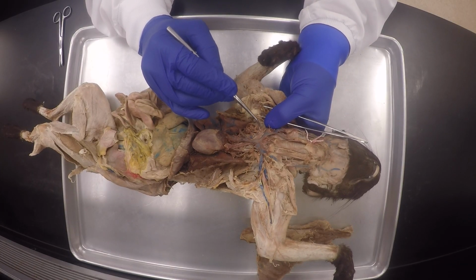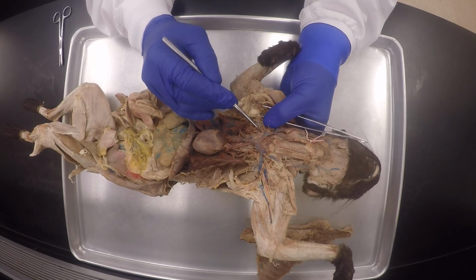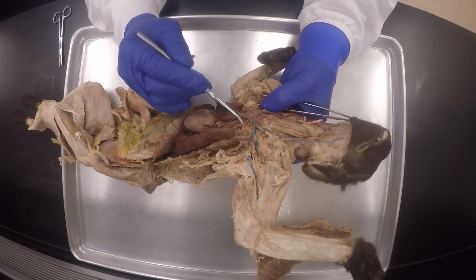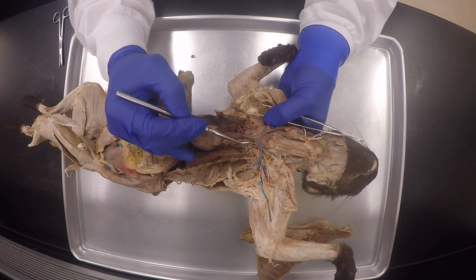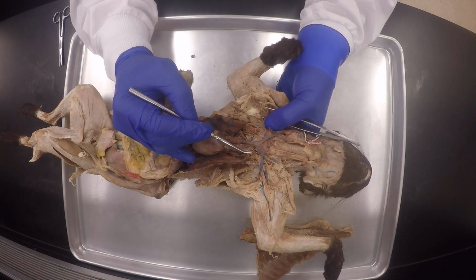Like I said, there's the internal mammary, you can see the red here, internal mammary artery on the right. On the left, this would be it over here. Do you see it, my good friends? It's not well infused, but you can see the two nipples that I was talking about.